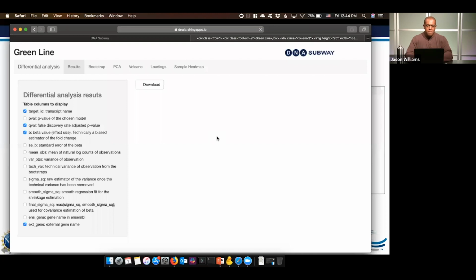This one is more of a statement than a question from Doug about prostate cancer RNA-Seq and loads of data on different sized tumor and normal tissues. So I'm assuming you're maybe asking questions, Doug, about whether you can use this yourself. And really, yes, you can. You may want to think about how you separate those experiments into something that makes sense.